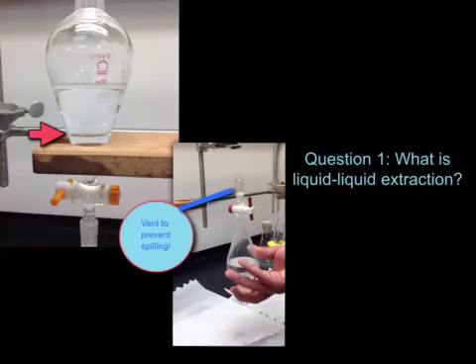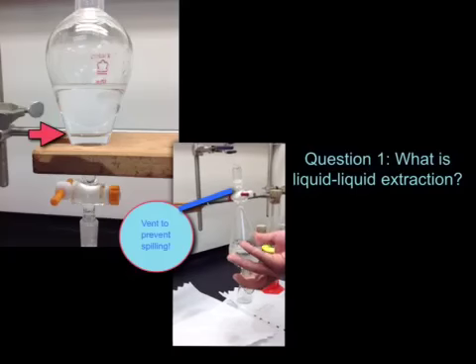When doing an extraction, we did a method of liquid extraction, which is basically separating the compound between two immiscible layers based on their solubility. For example, in the picture to your left, you'll see inside the separatory funnel two liquids separated because they're immiscible, and you also want them to reach equilibrium. So in order to reach equilibrium, you would swirl the separatory funnel as demonstrated in the video right down below.